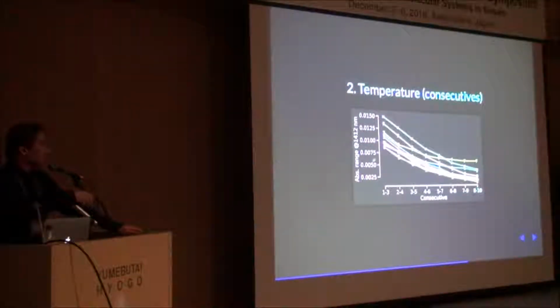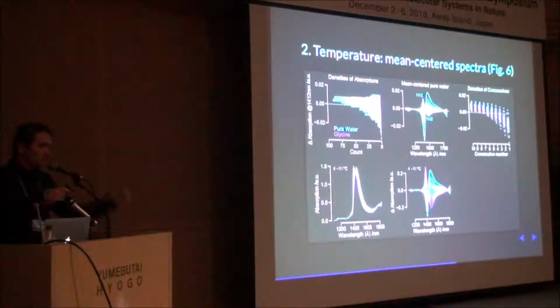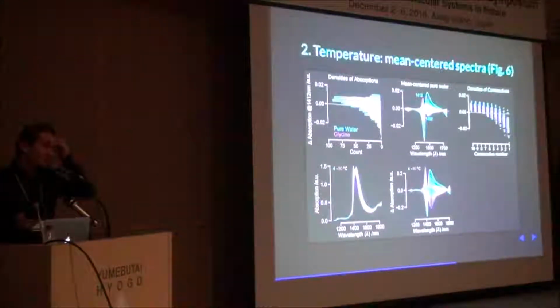So another thing that I did is I played with these consecutives again. And here I took a window. So I have 10 consecutives, and I'm looking at this data. I take 3 consecutives as a moving window, and I calculate the variation for these 3. I want to see, are these consecutives next to each other? Do they have smaller variation or not?